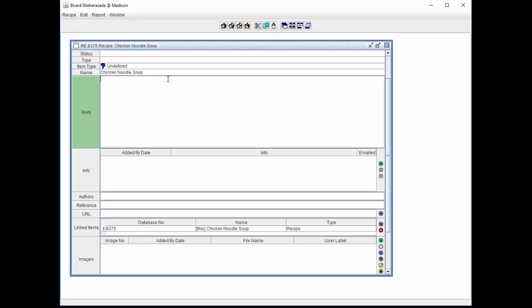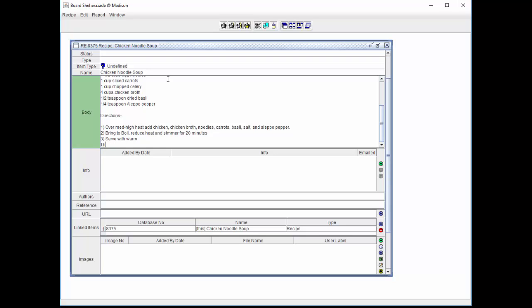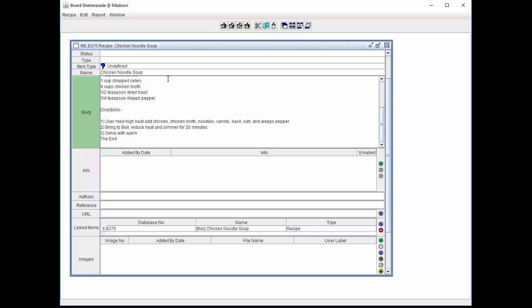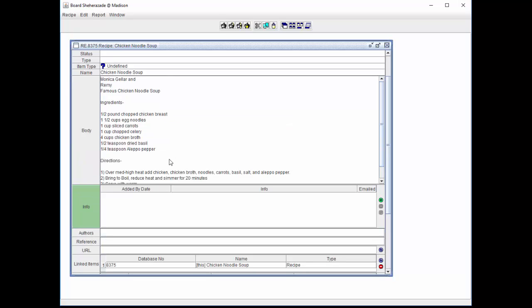The information can be added into the field by typing. After entering the information and clicking on a separate field, it is shown that the field is resized as needed.